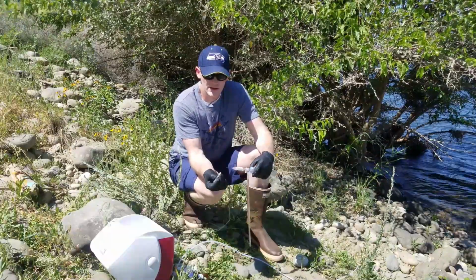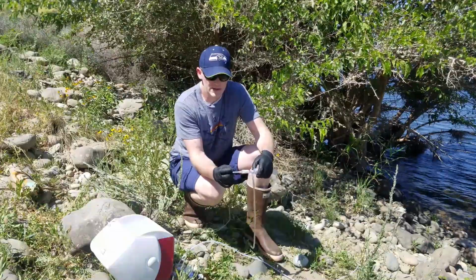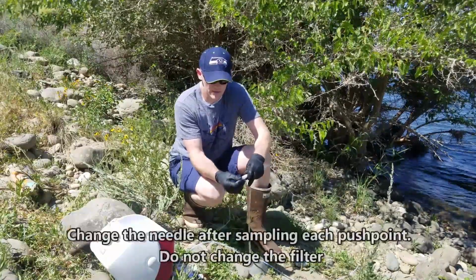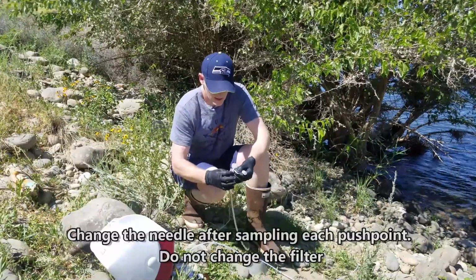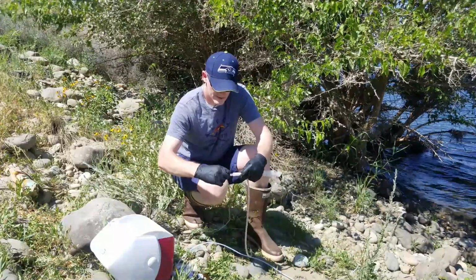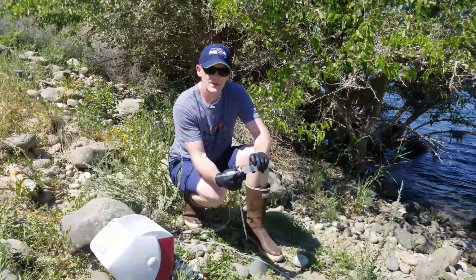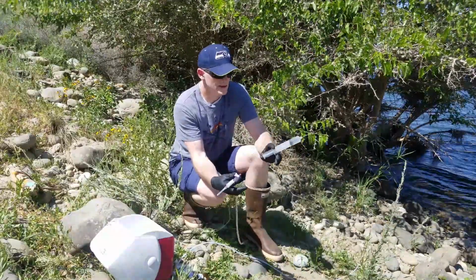Next thing you want to do is cover up the needle, and we're going to change the needle. The reason is that we put the needle into a vial with acid, and we don't want to get acid into the clear vial. So we're going to swap off to a new needle. Make sure not to touch the inlet of the needle or the outlet of the filter. So get that on there. Now at this point you can take the syringe off of the three-way valve. You can discard the excess water.